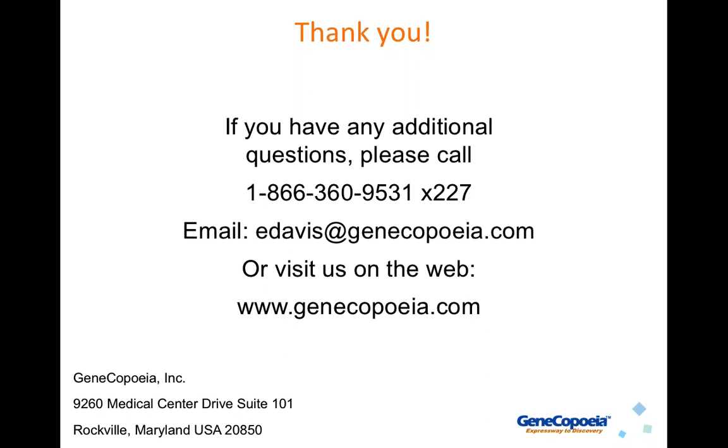Okay, next question. At what point can I verify at the protein level the effect of my gene knockout using CRISPR? Well, again, as I mentioned before, you should check to make sure that you have a complete knockout first by using the indel check kit and sequencing to make sure that all alleles of your gene are knocked out in the cell line. Okay, next question.